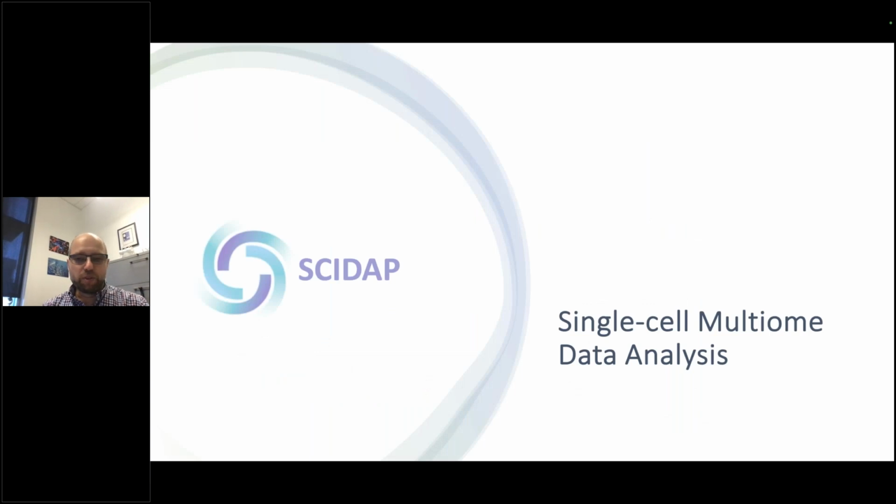Now we will move to the topic of today's webinar, which is how to do single-cell data analysis in SciDAP.